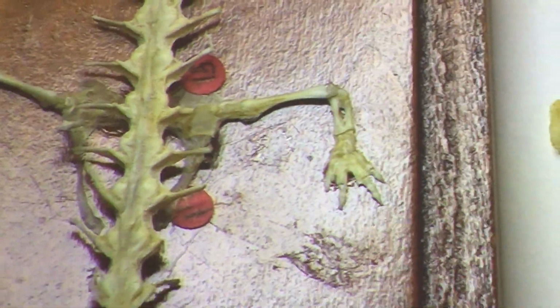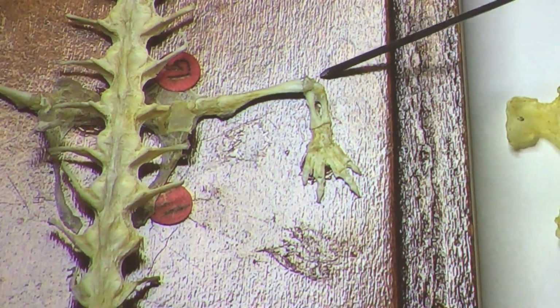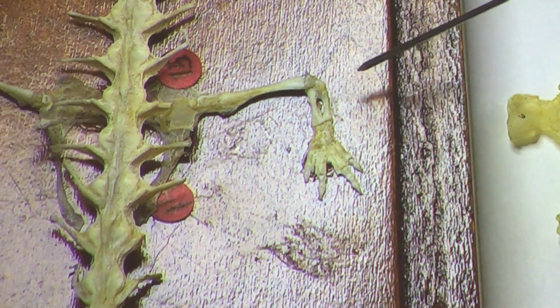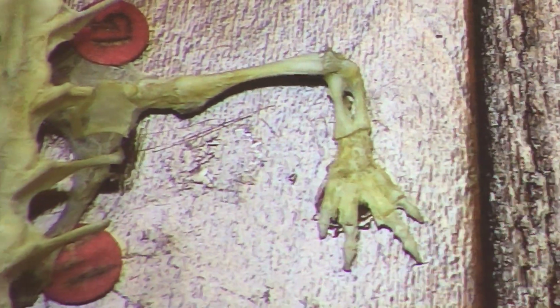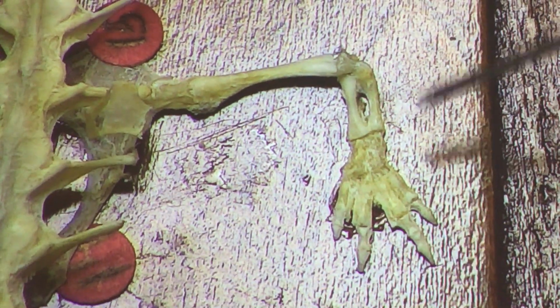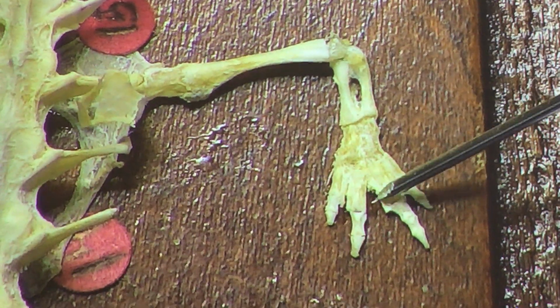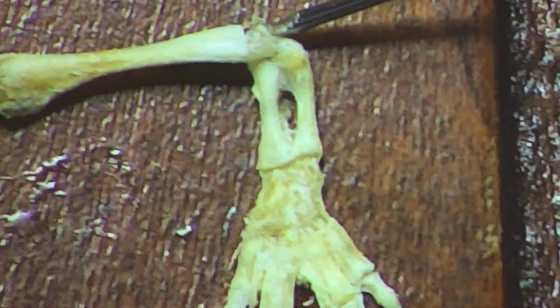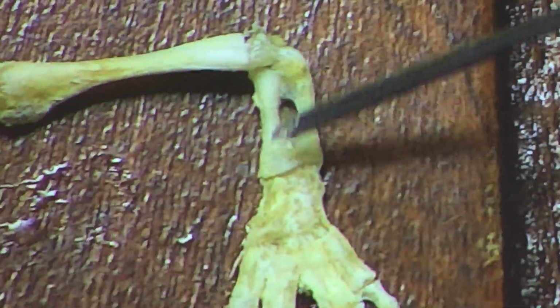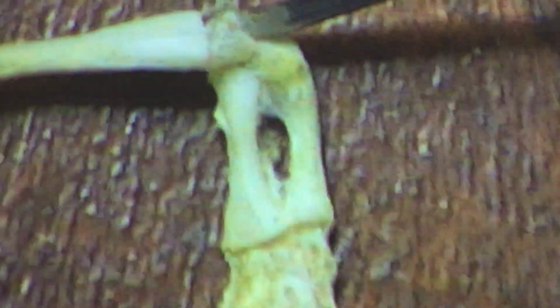If you go in your push-up position, where's your radius? Where's your ulna? So radius will be along the midline. Ulna is lateral. But what's kind of cool when you look at this, look really closely. Think about how your radius and ulna were, or the cat's. The head of the radius that's closer to the elbow was small. The one further away at the wrist was large. Whereas with the ulna, close to the elbow was big, further away was smaller. We see the same thing here. And if you look really closely, you can see the elbow cupping or being cupped by the ulna. Right there, just like on a kitty cat.